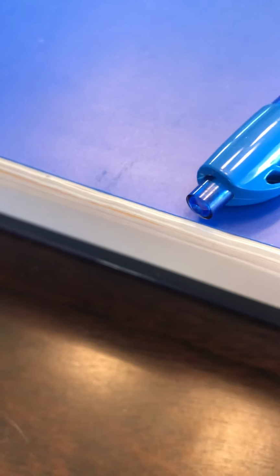Experiment 2, now with the balloons and the hydrogen peroxide: cold, hot, and room temperature. The balloon circumference I measured was 11 centimeters, so that goes for all 3. Number 1, cold, the temperature was 11 degrees Celsius. The balloon inflated from the reaction was 16 centimeters.